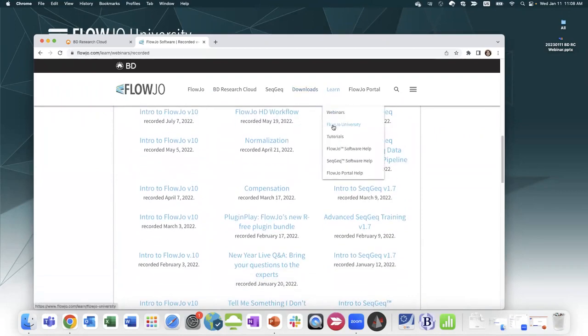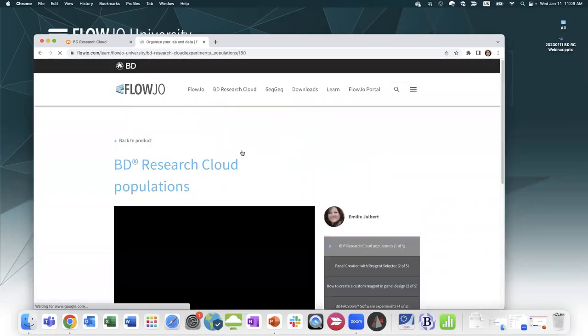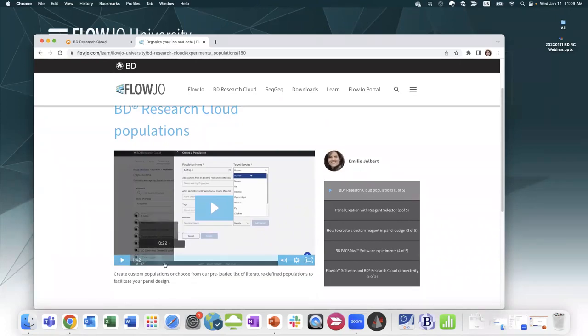Also, if you go to FlowJo University and click on BD Research Cloud, then we have some short videos to remind you how to do some more common tasks. So how to upload a cytometer, how to create a panel. And so these are just a few short minutes. So you don't have to watch the whole webinar if you're looking to remember how to do certain things. So these are available on flowjo.com.